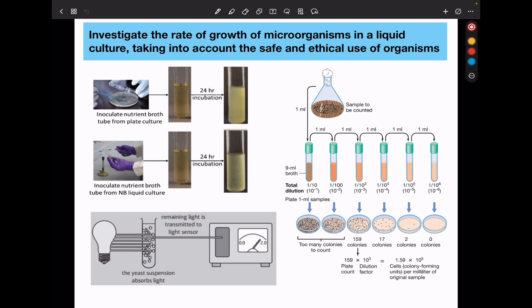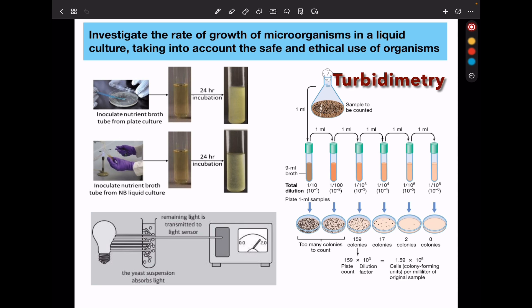In this experiment, we can use the turbidometry method or dilution plating culture in order to quantify the number of microorganisms. You could also use turbidometry accompanied by hemocytometry to get accurate results. If you are using the turbidity method, the greater the turbidity of the liquid culture, the higher the concentration of microorganisms. Turbidity is measured at regular intervals.